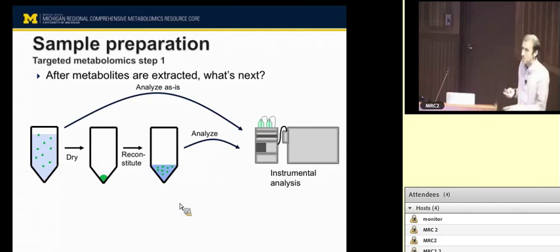Untargeted is maybe what you might think of the true discovery omics sort of science. And so if you don't know what you're looking for, if you have a condition that you're trying to study, a treatment and control. Yes, question.